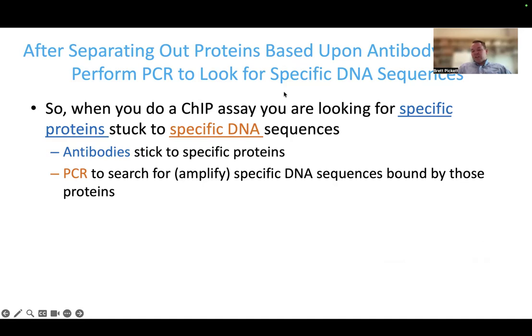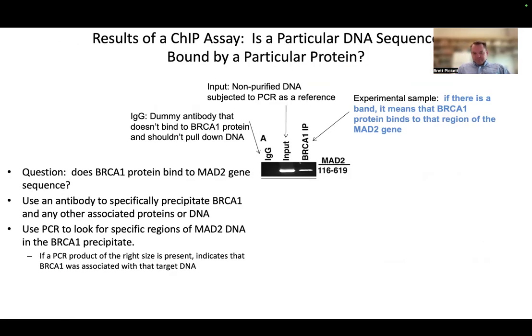Well, we also have to have an idea of which protein we want to look for before we even start, so we can find an antibody against it and attach that antibody to the bead and make sure that the proteins that we want are coming out of the solution too, if they're precipitating out.